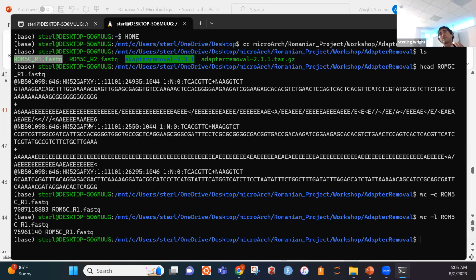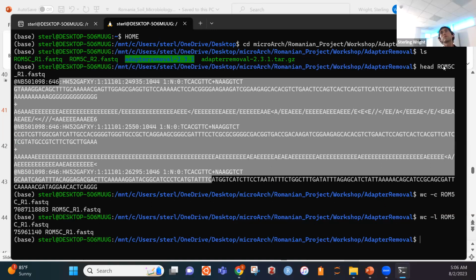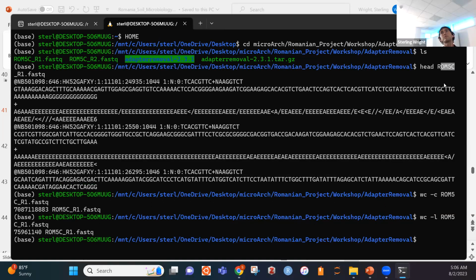People also have other pipelines that are automated in a way that assumes your data is following this specific structure. So for reproducibility, I would advise not modifying the names. The key thing is that we just have to know all these DNA sequences belong to the sample. As long as you have all that information tied to this specific sample, you don't necessarily have to change anything within that file.